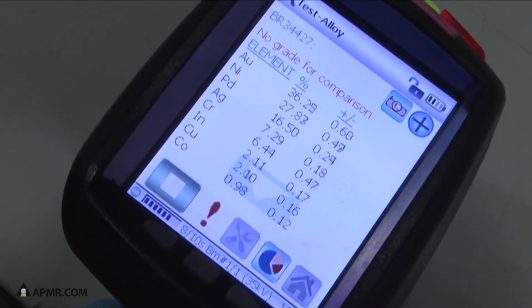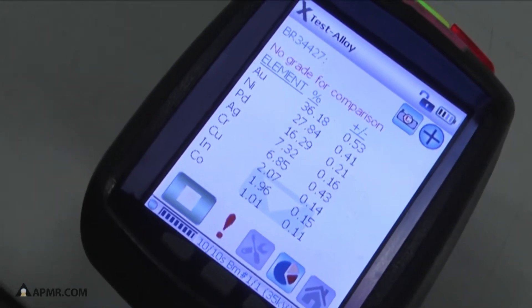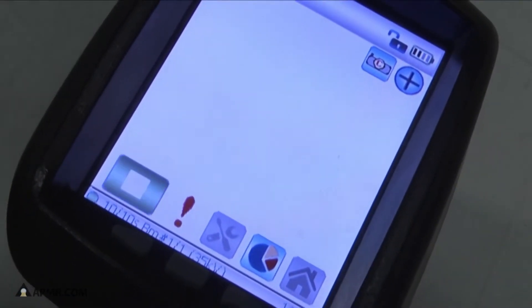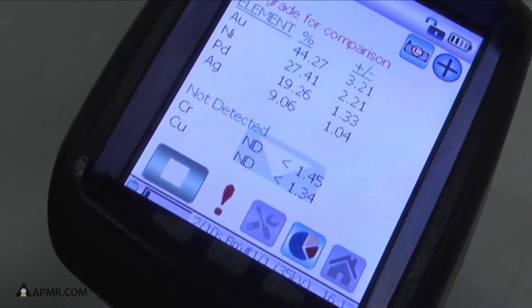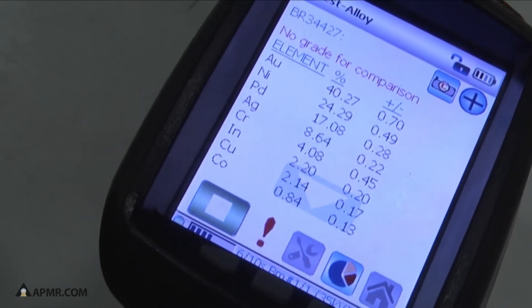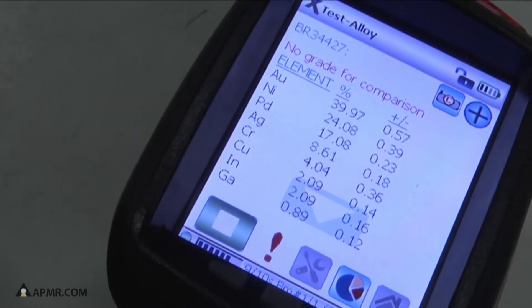In about 10 seconds we will have preliminary results of the makeup of this bar, at least the top side of this bar. Now we're going to flip the bar over and look at the bottom side. We do this to ensure that the bar is homogenous and that all metals are equally distributed throughout the bar.